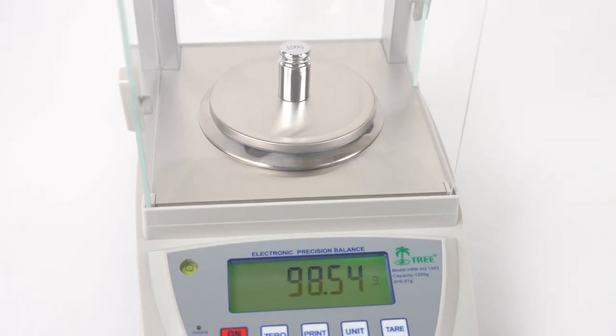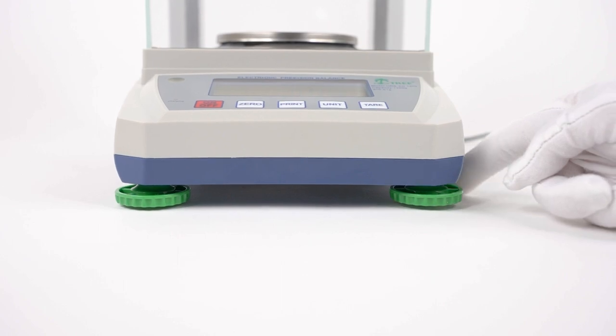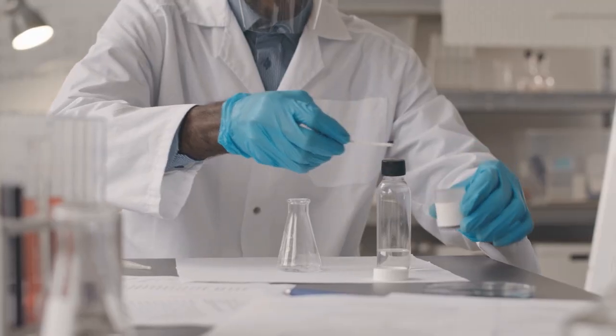The HRB-XG is a series of state-of-the-art, high-resolution balances for weighing chemicals and fine powders.